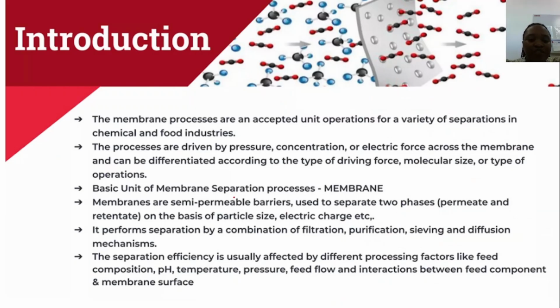So the introduction: membrane processes are an accepted unit operation for a variety of separations applied mainly in chemical and food industries. The processes are driven by pressure, concentration, as well as electric force across a membrane, and can be differentiated according to the type of driving force, whether it's pressure, concentration, or electric force. They can also be differentiated by the molecular size of what is separated and the type of operation.